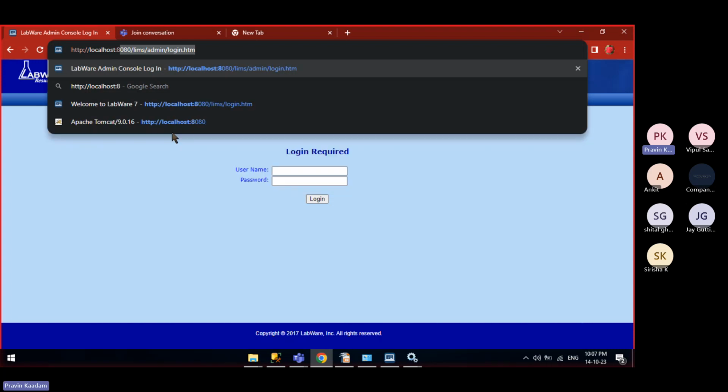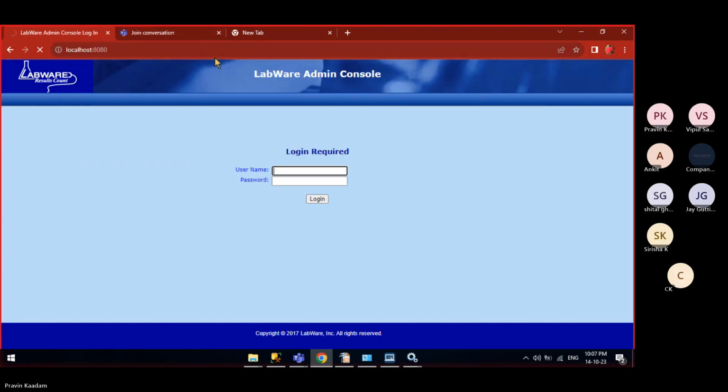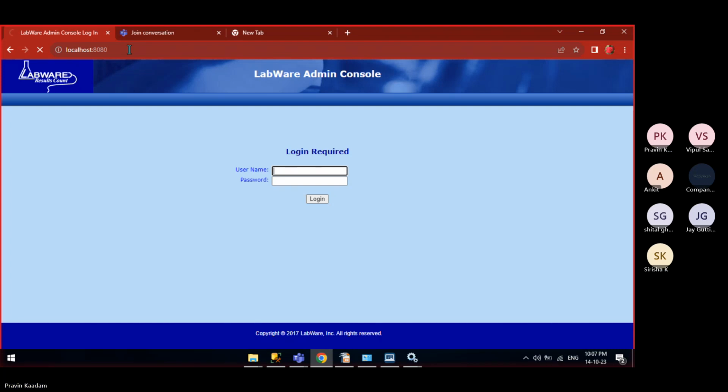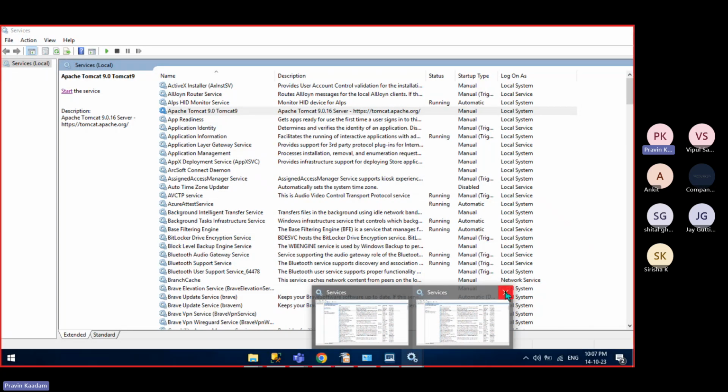And this is the default port number used by Tomcat, 8080. Enter. So what we did is simply IP address of host server :8080. This should take us to the Tomcat web page if the Tomcat service is running. Since we have just started it, it will take about 1 minute or so.